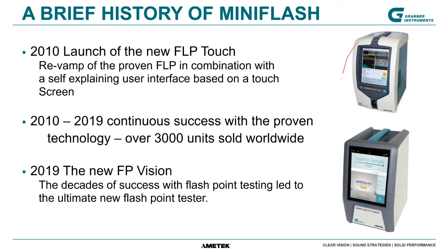Also here we have two newer generations. The latest one is the Vision, which we have just launched last year, and the Vision replaces the FLP Touch that we had since 2010.